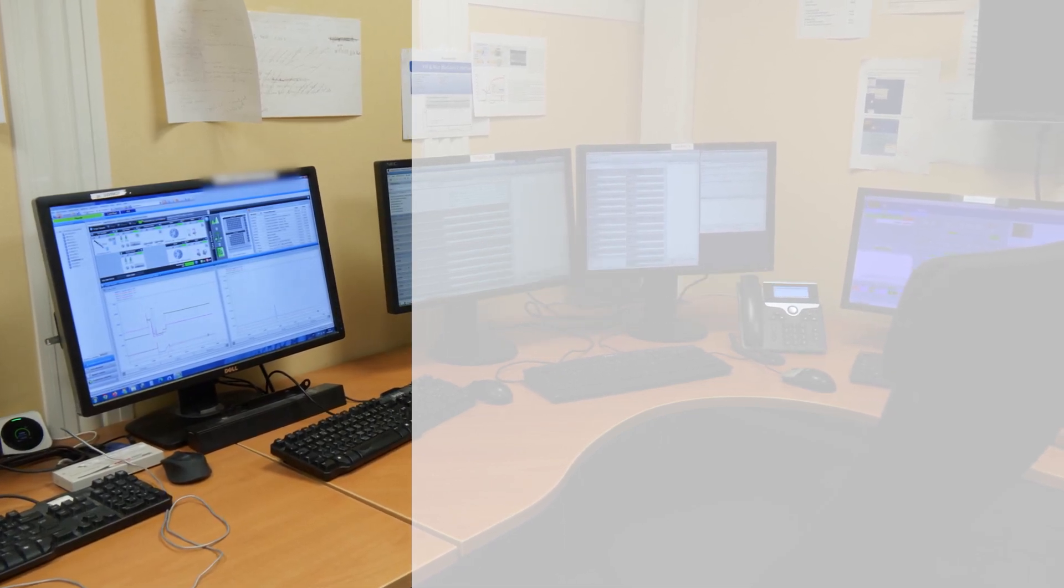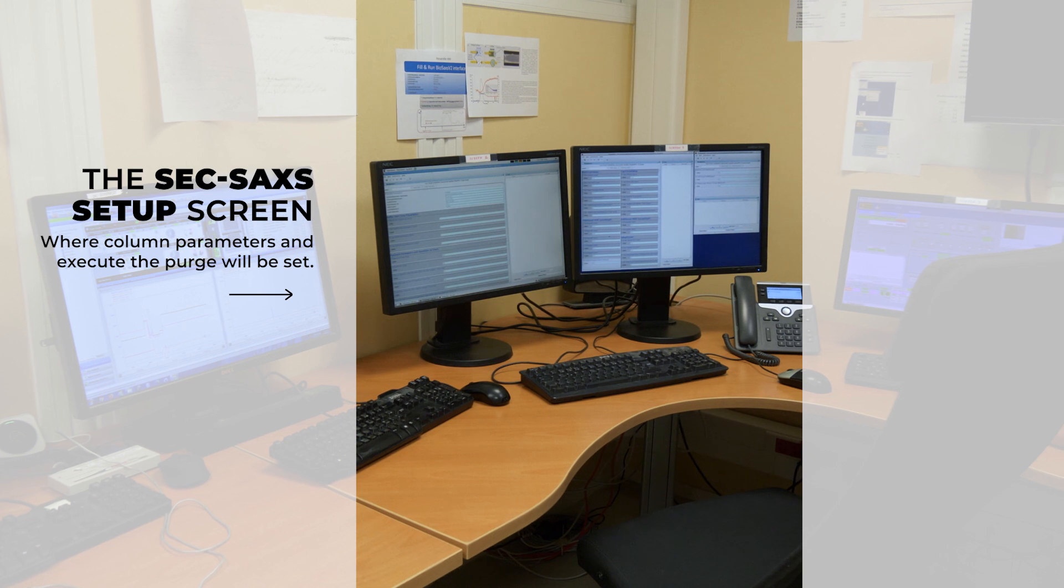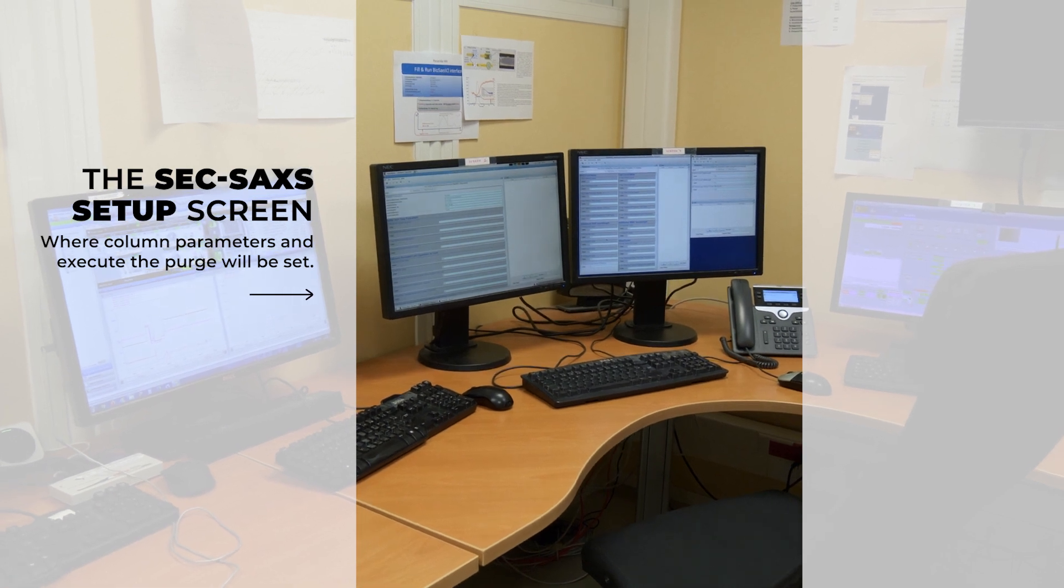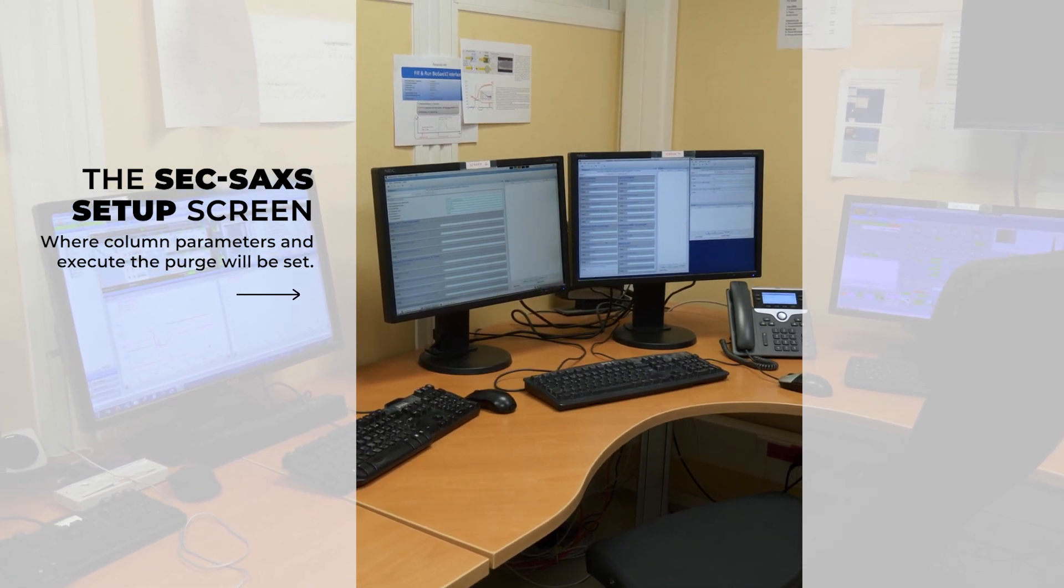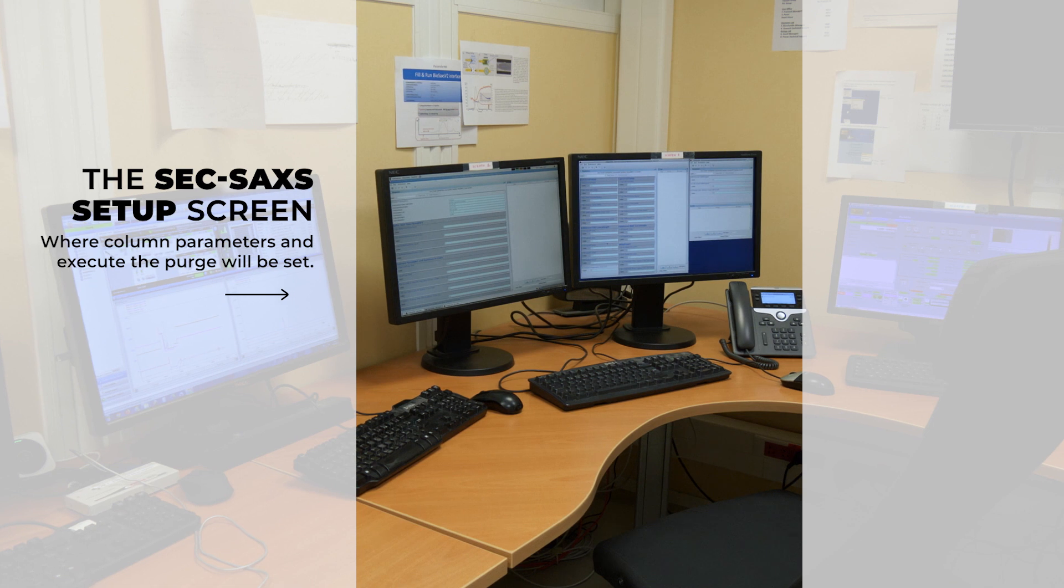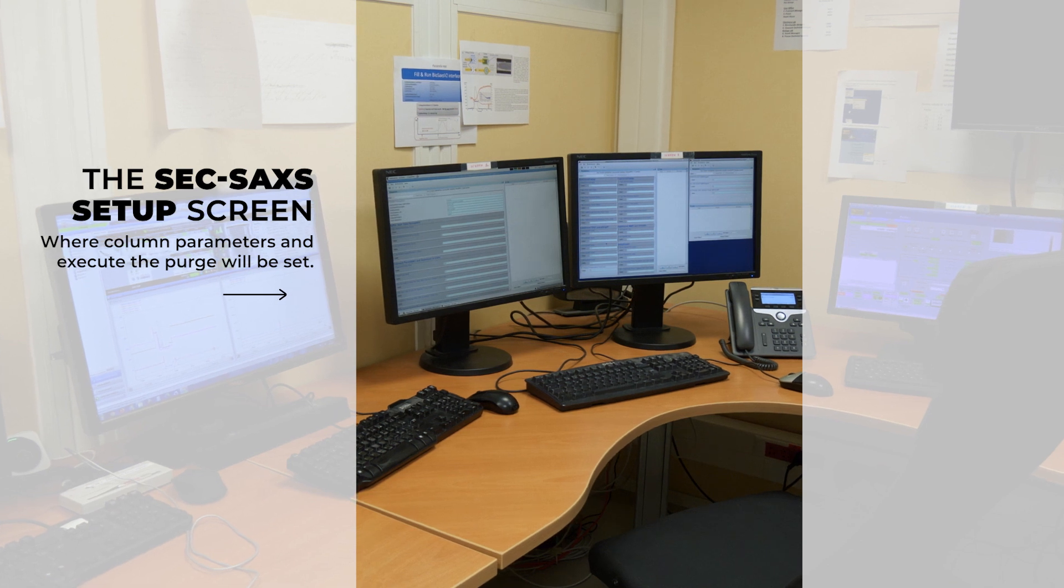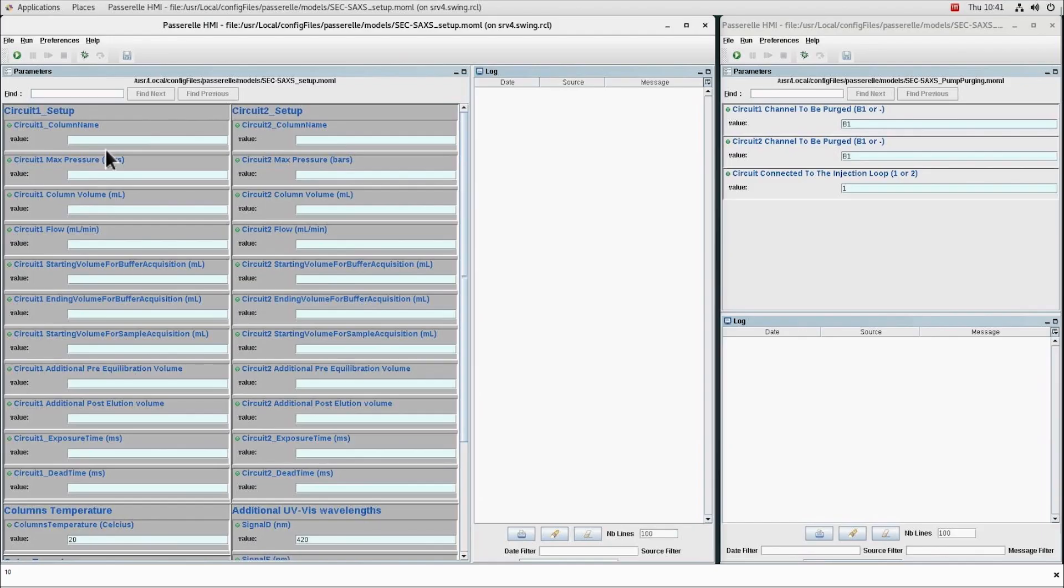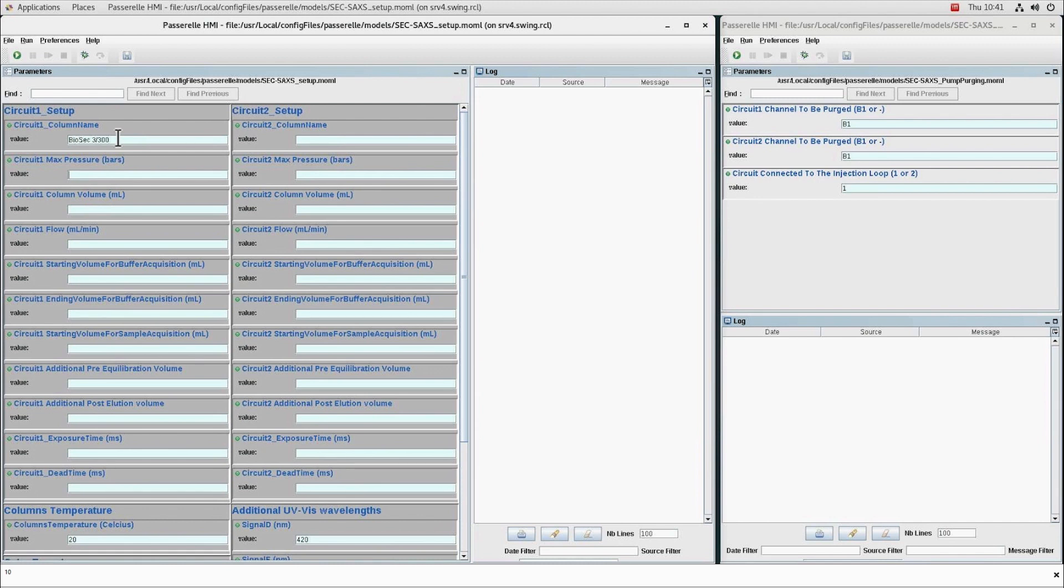The SEC-SAXS setup screen is where column parameters can be set. To execute the purge, first on the SEC-SAXS setup screen, the following information about columns needs to be specified: column name, the maximum pressure allowed for the column.